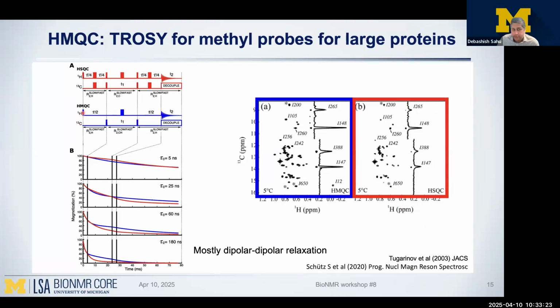Okay, so in an HMQC experiment, again, you have the same component over here, wherein you transfer the magnetization from proton to carbon. So here you have a multiple quantum term. In an HSQC experiment, at this point, you'll have a single quantum term. So that is what HMQC stands for, and HSQC is heteronuclear single quantum coherence.